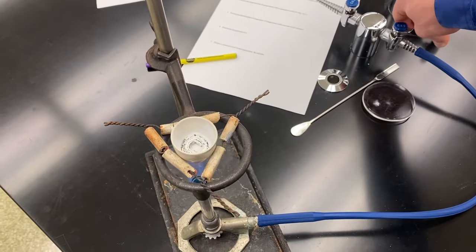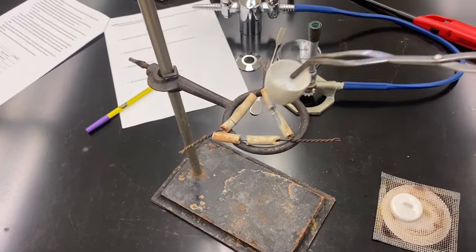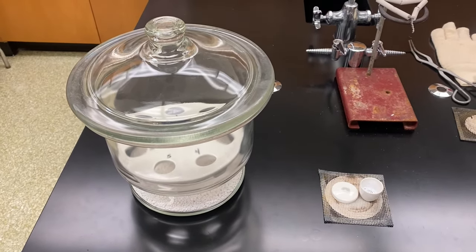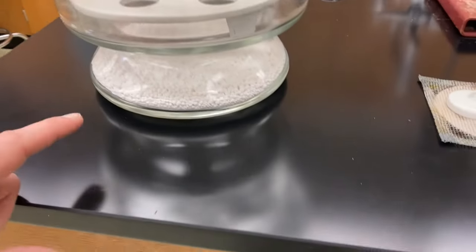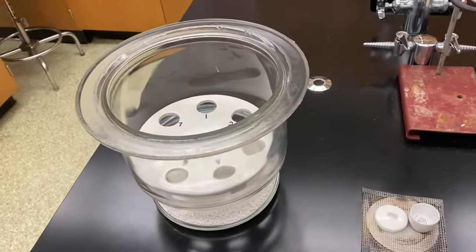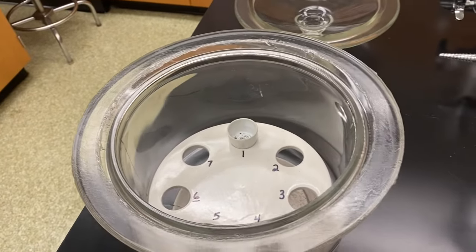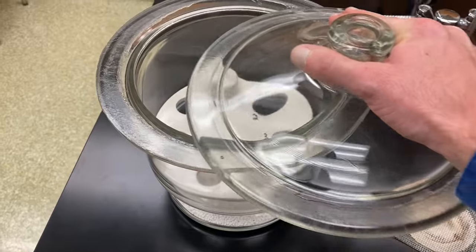I'm going to remove my heat, shut off my gas, and set my burner aside. I'm going to remove my sample from the clay triangle and put it on the wire gauze to let it cool. So that my crucible doesn't get extra water from the air and affect my mass, I'm going to let it cool in a desiccator. A desiccator is a chamber that has calcium chloride in the bottom that helps absorb any of the moisture in the air. I can open my desiccator by sliding the lid off — it's got vacuum seal grease on it. I'm going to place my sample in the desiccator to continue cooling and replace the lid.